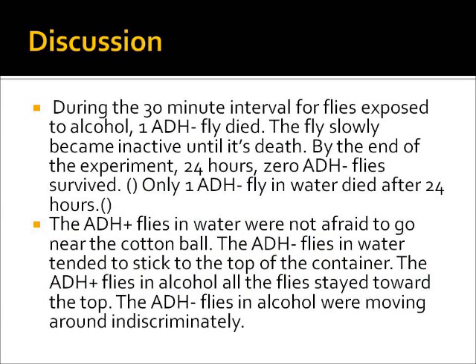The results that we got from our data were that in ADH minus flies put in water, we experienced 1 death at the 24-hour period. Whereas with the ADH minus flies in alcohol, we experienced 1 death at the 30-minute interval, and then at the 24-hour interval, we had 0 flies, which meant the remaining 2 flies had also passed away.